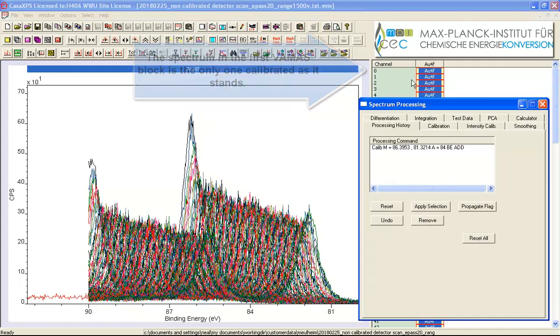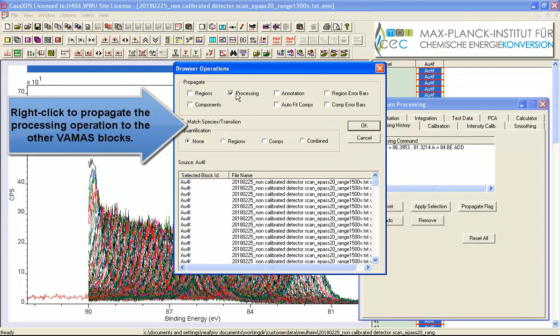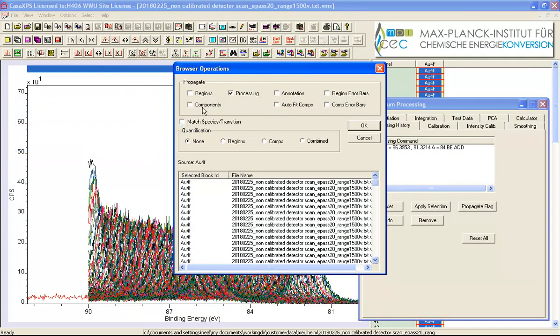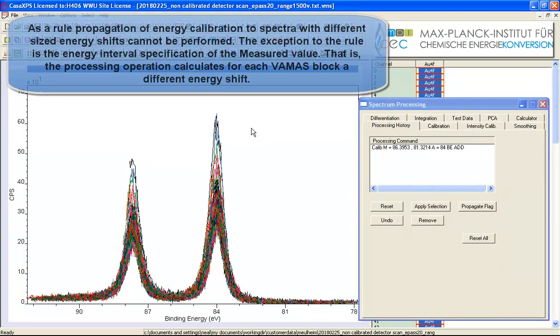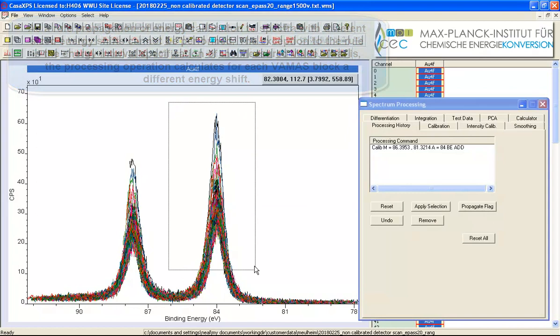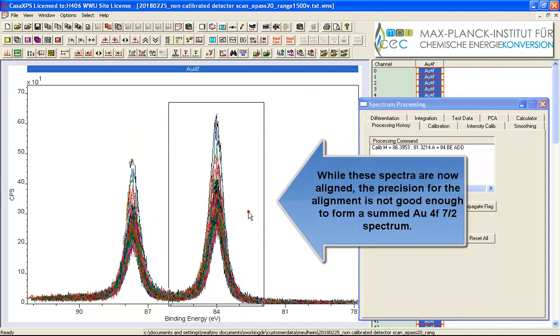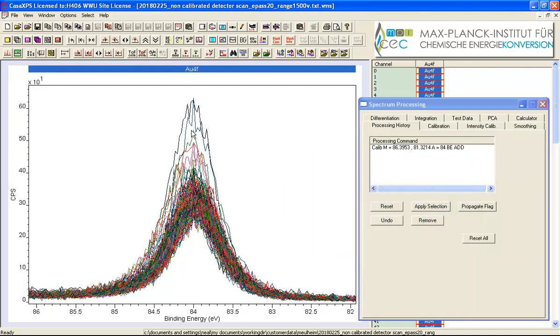So now these are all selected so I can now propagate the processing. So I've got the processing tick box active, none of the other tick boxes active and I say OK and what will happen is it will propagate the processing based on an interval to all of these data so we now have data that are calibrated so that the gold 4f7 halves peak align and we could in principle sum these in this form to obtain a spectrum.